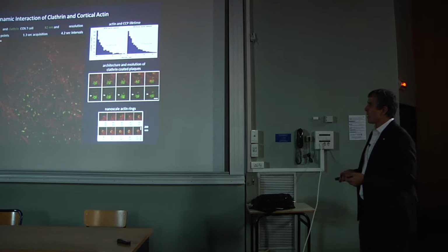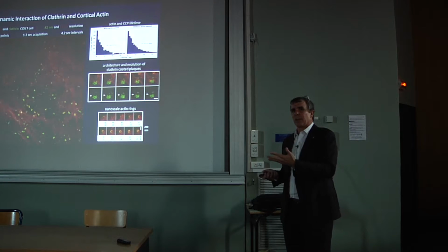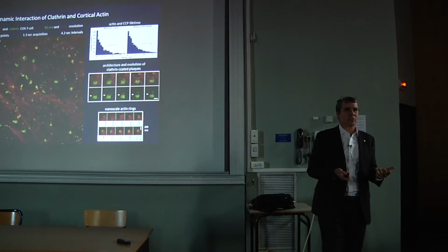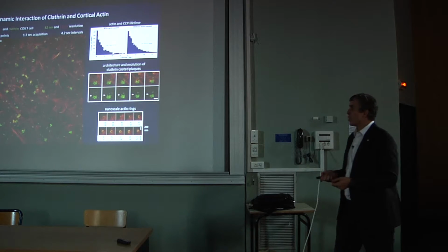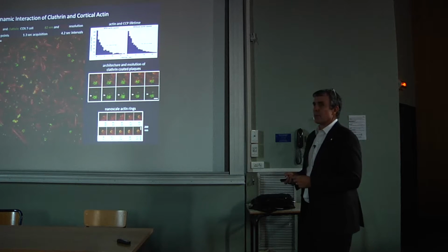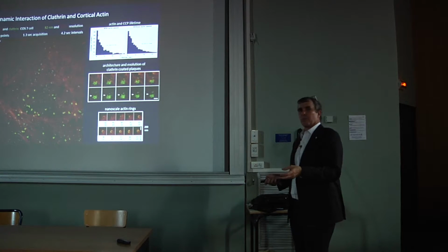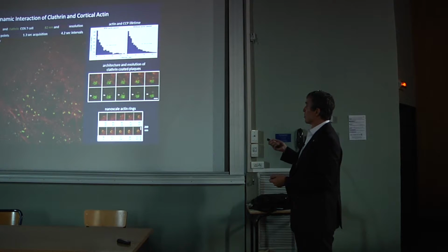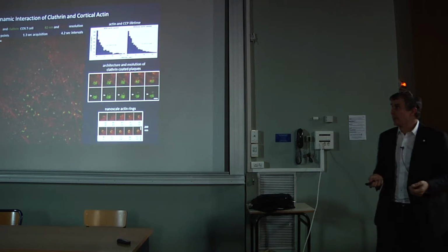So there's been a lot of debate in the literature about the role of the actin cytoskeleton in clathrin-mediated endocytosis and whether it facilitates that. What we found is that in only about half of the cases, right before endocytosis, actin is recruited. But when it is recruited, there's a small but statistically significant shortening of the lifetime.